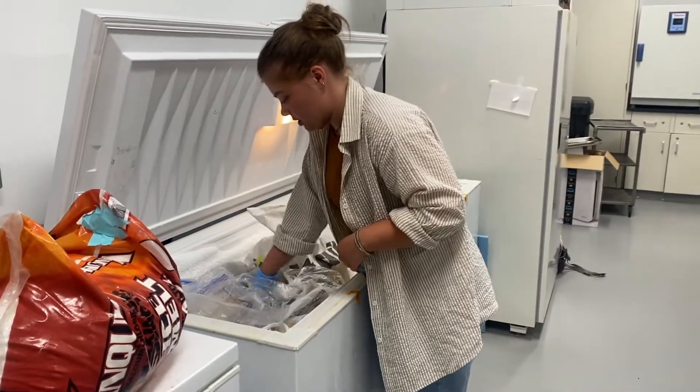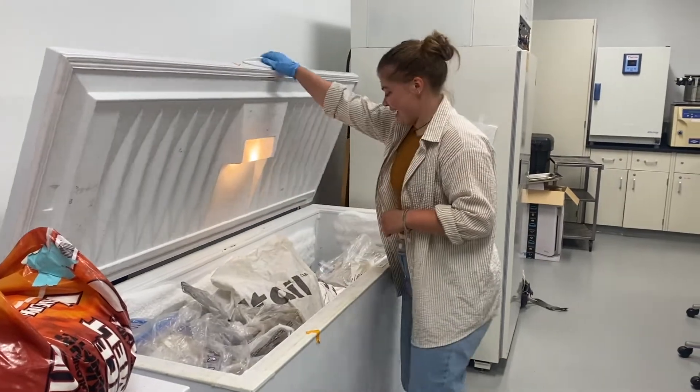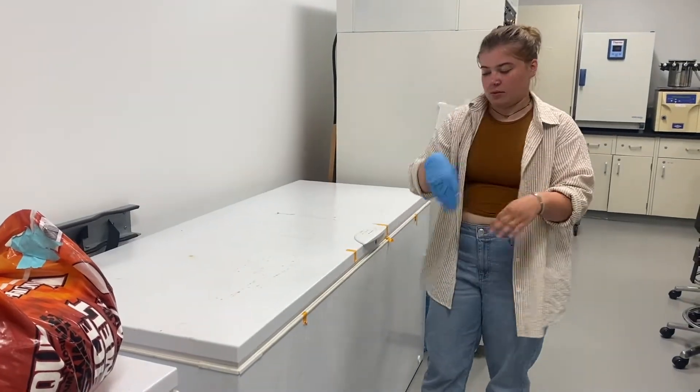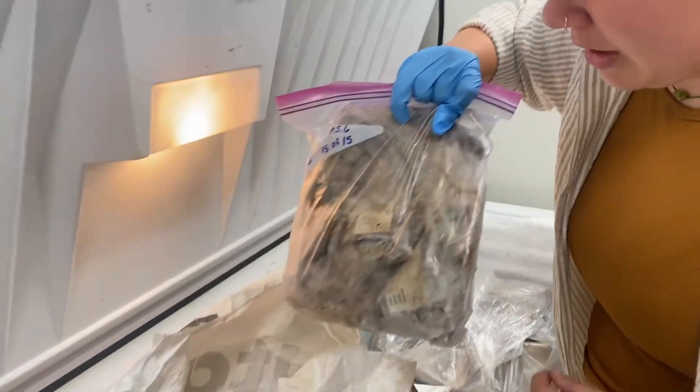This is where we keep all of our fish frozen to make it less stinky and gross. Then we take them out and start dissecting them. They're frozen in these little ziplock bags — there are small ones and big ones.